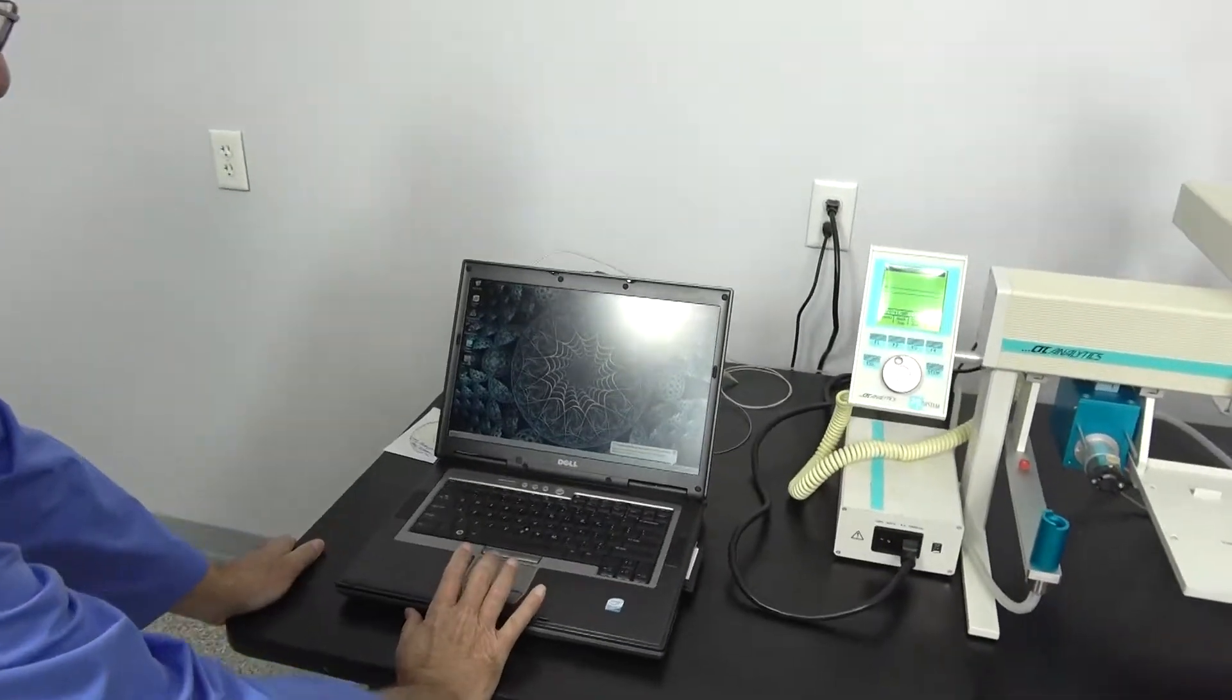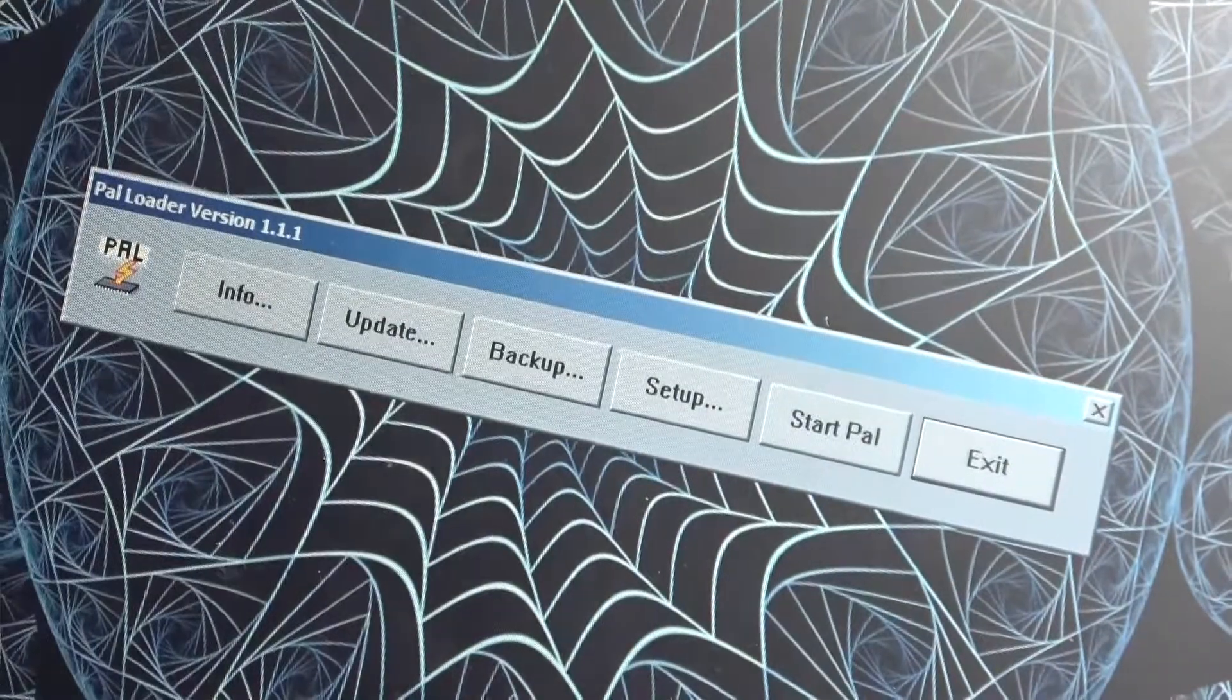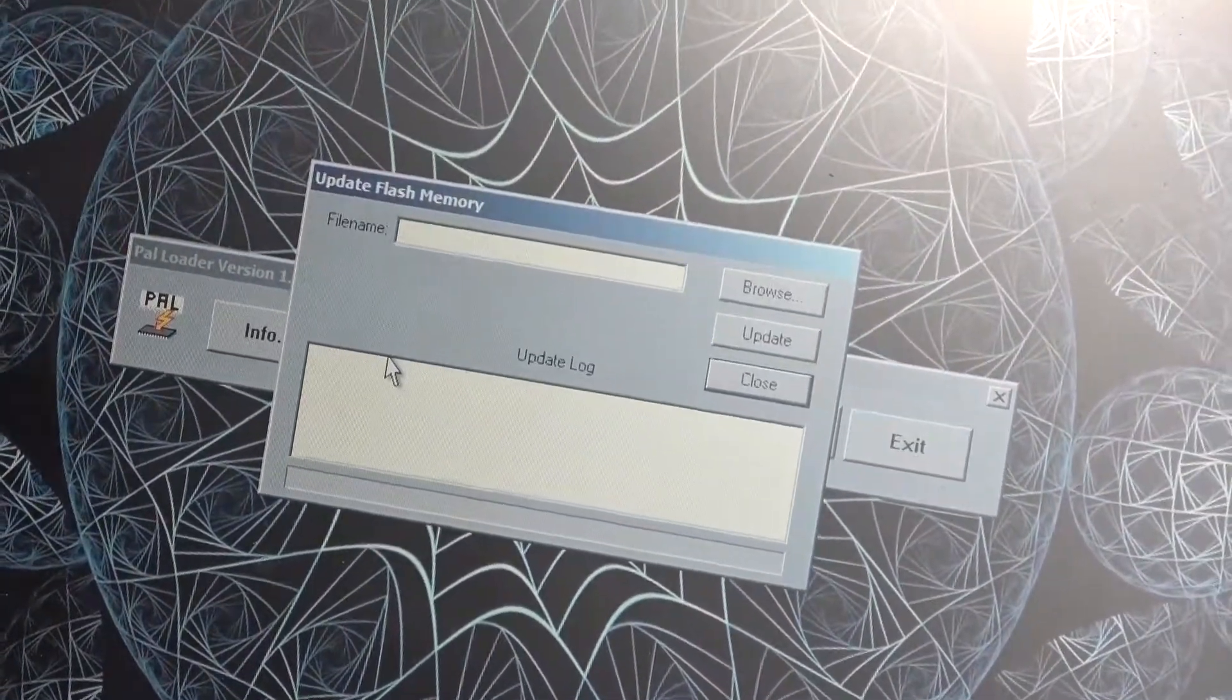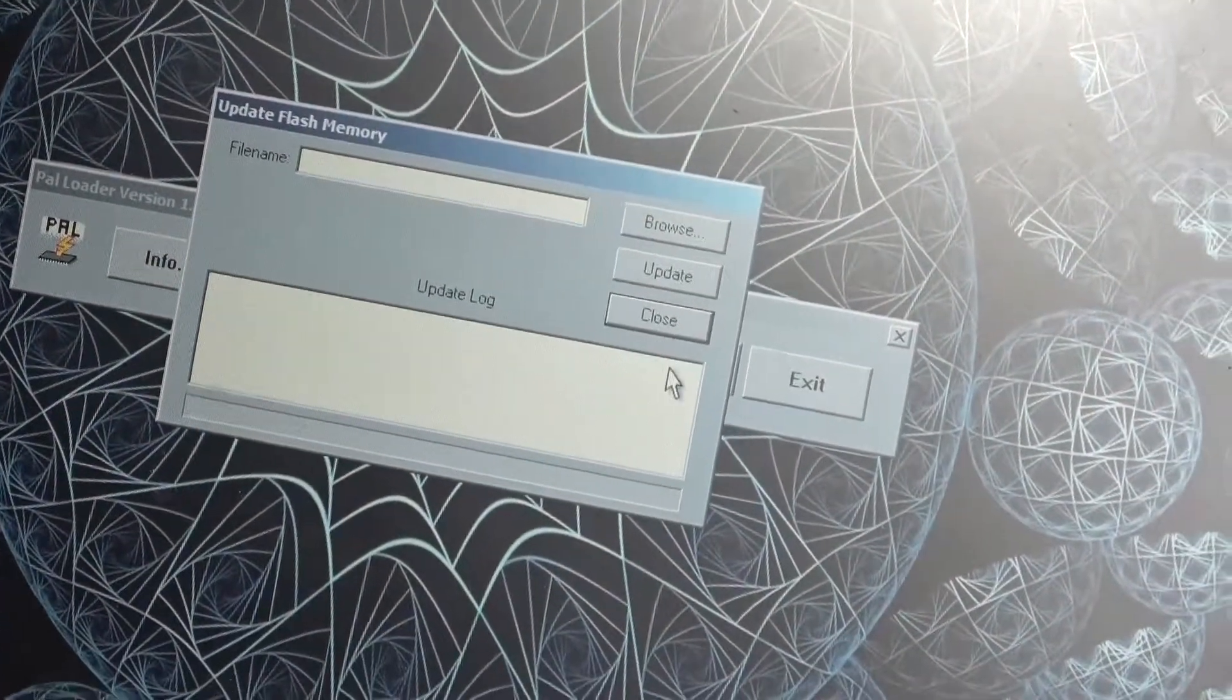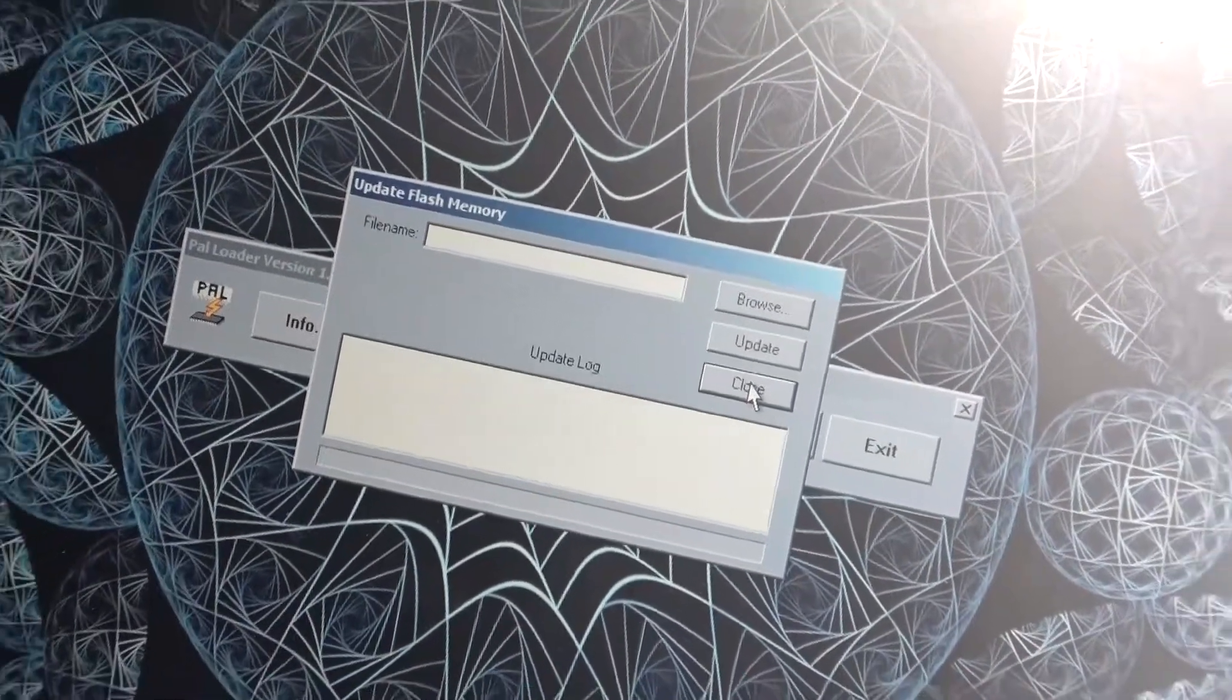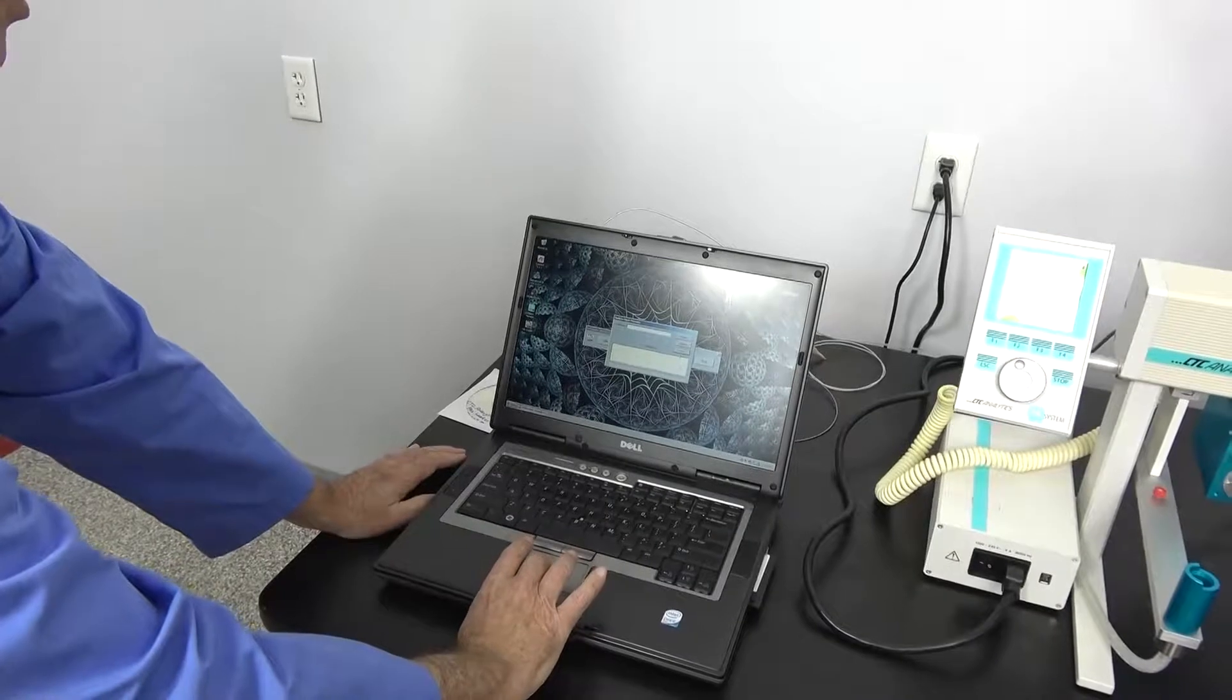The PAL Loader is the one to change your firmware settings or to upgrade, downgrade, or back up your system. It's very point and click where you tell it you want to update and when you do that, you need to browse to the version of your software. The CD comes with several different versions. Normally the last major versions such as 2.4, 2.2, 2.5.2, 3.04, those are the last version numbers.